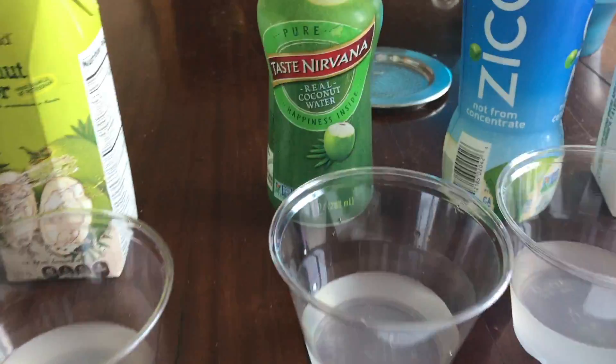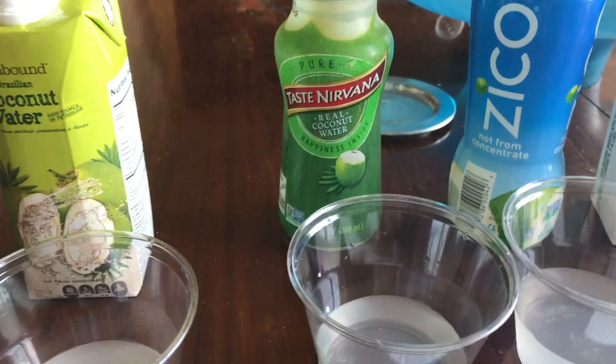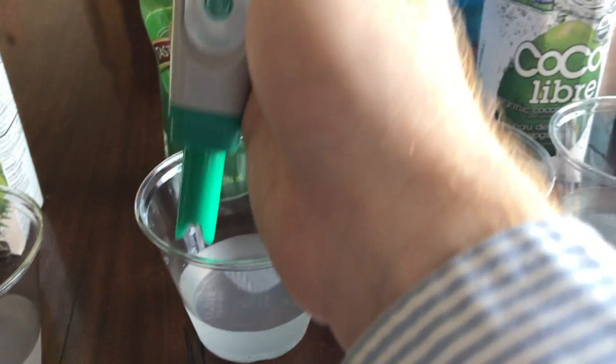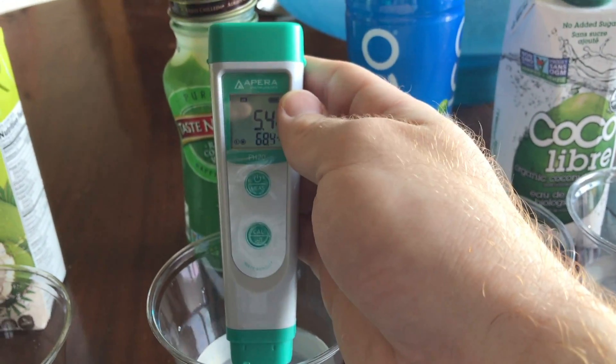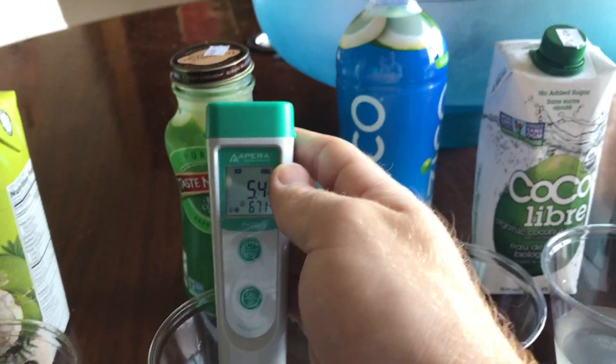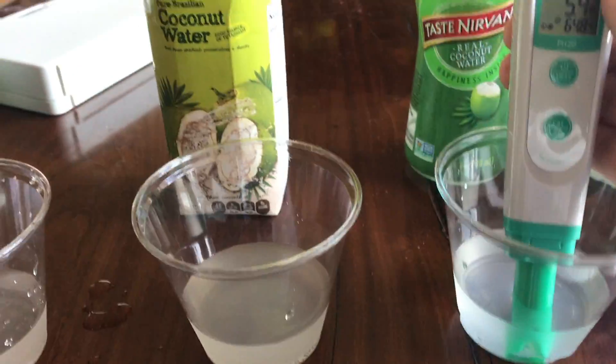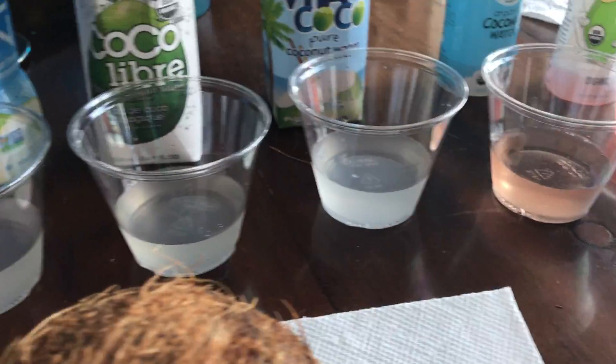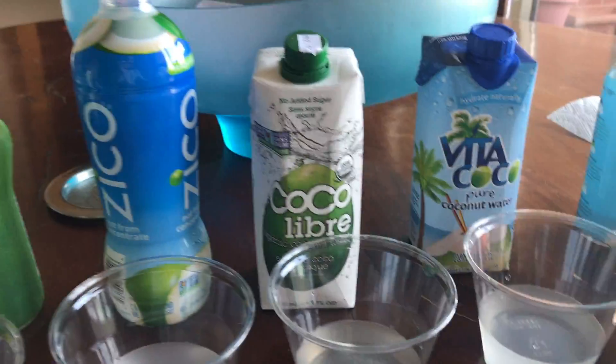Taste Nirvana. This one's a little bit more expensive — I'm wondering if that has an effect on the pH level inside the bottle. Let's test it. We have a pH of 5.4. That's much better than Abound coconut water and closer to real natural coconut water. Just going to recalibrate it again and move on to the next one.